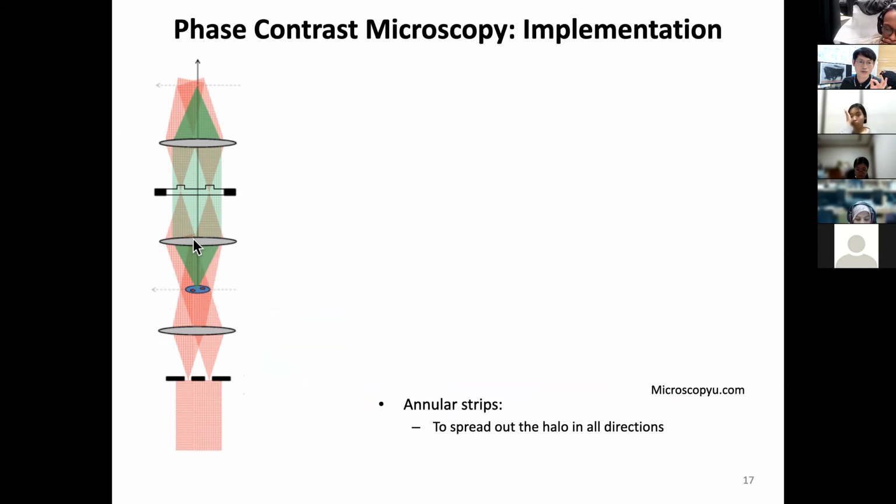And then these parallel rays will focus down over here. At that focus, you want to put the proper phase retardation to convert the phase information of the sample into the intensity. So see this red one become converted onto your image. Likewise, the other side is doing the same. And you do this kind of circularly.